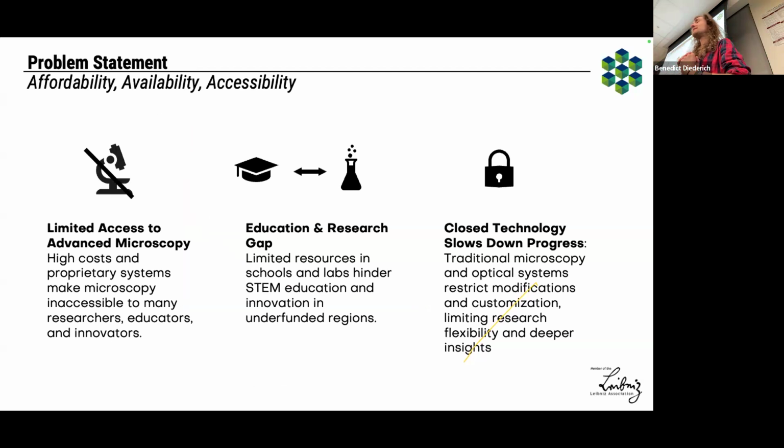But since teachers don't have printers or cannot buy these parts, because if you typically buy these, say like, I don't know, €10,000, like one kit from Thorlabs, for example, there was a bit of our mission to make these optics somewhat more available, accessible, and approachable. And this is also what this whole thing is driving, this open UC2.